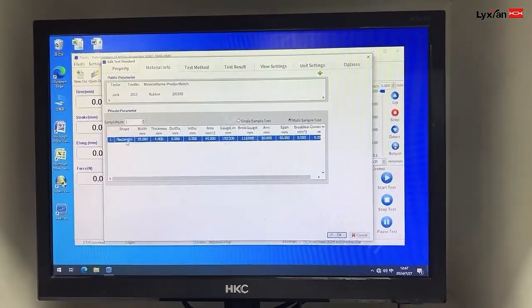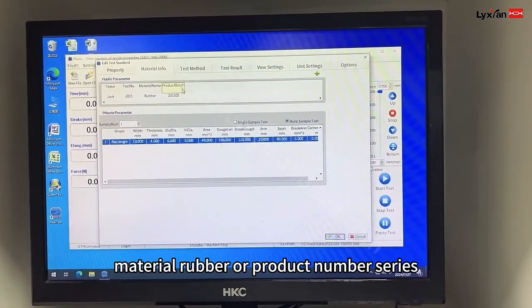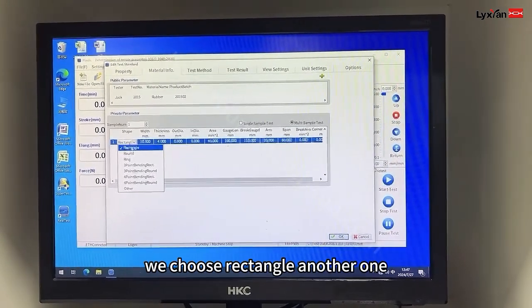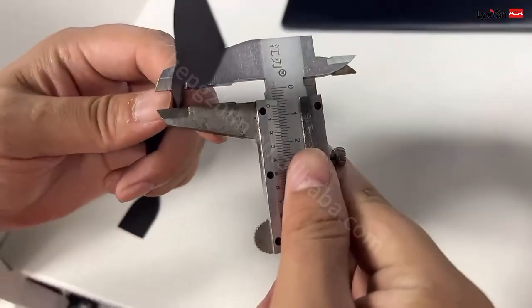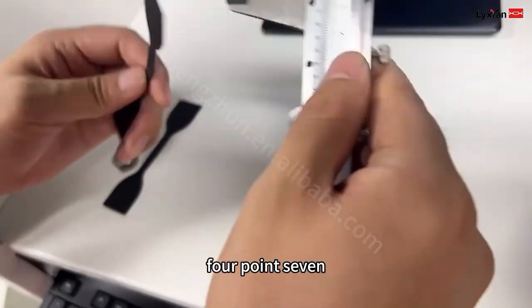And the second part, here, just input tester, test number, material: rubber, product number, series. And the shape — for rubber, we choose rectangle. Another one, you don't need to change. And weight — this one, weight. It's 4.3.